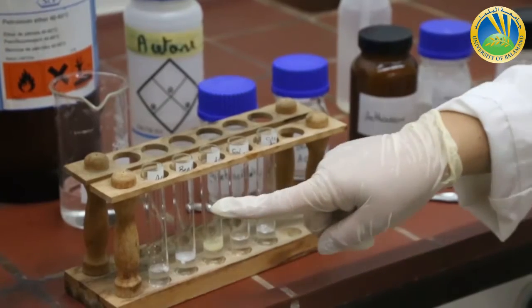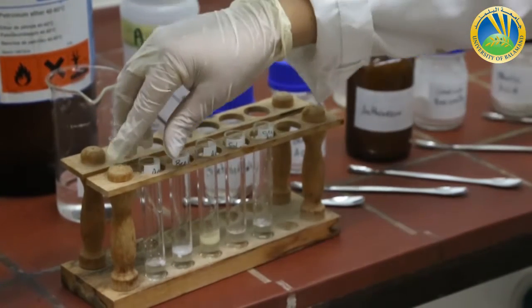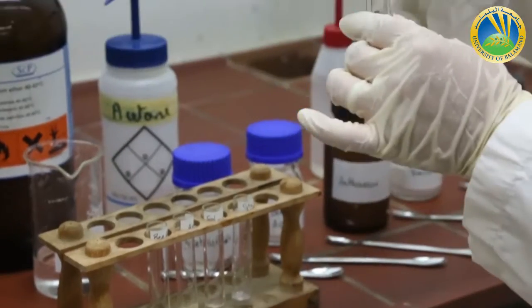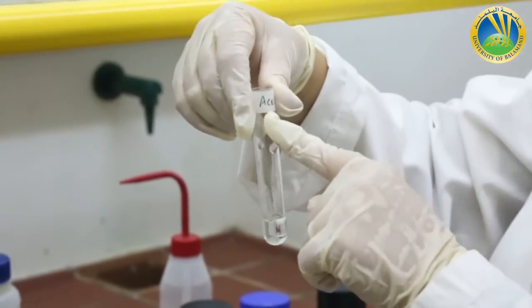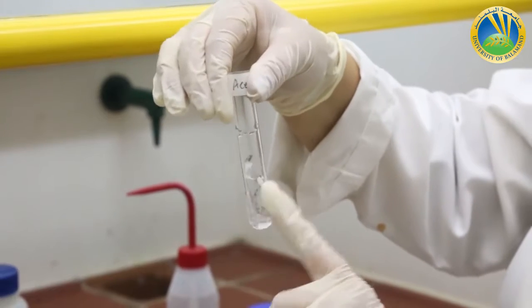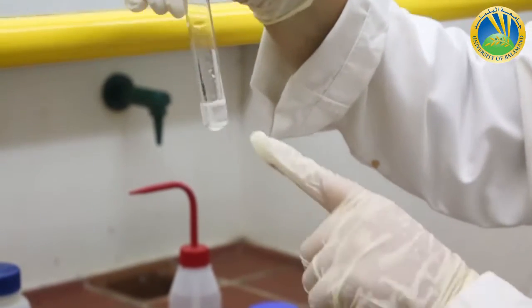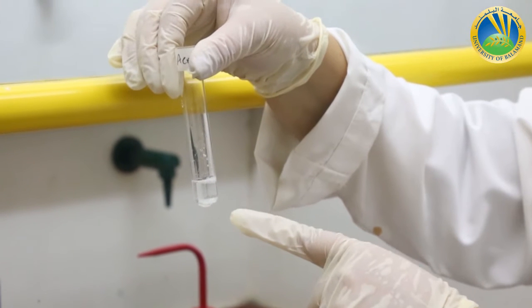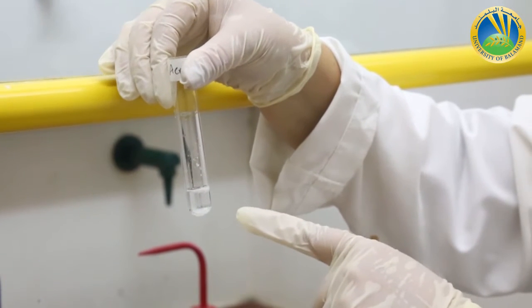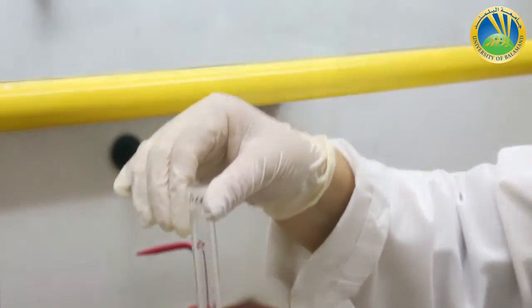I have prepared the solids inside the first solvent, which is water. I have to test their solubility at cold. Now this is acetanilide inside water at room temperature. If I shake well, I can still see the acetanilide crystals. So I can say that acetanilide is not soluble inside water at room temperature.